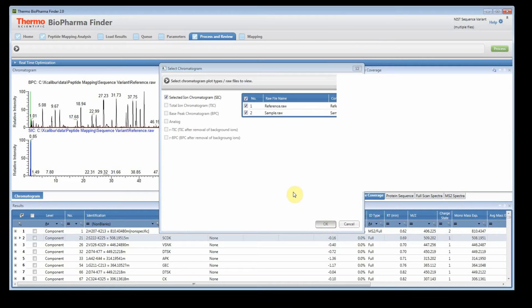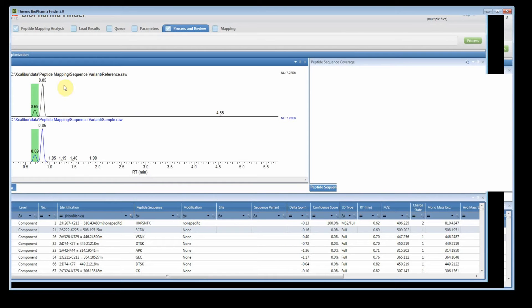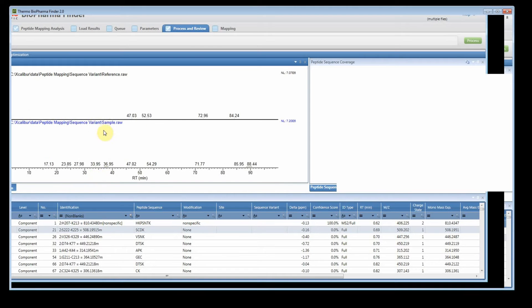Now when I click OK, it's going to start reading both files. And it can take a few seconds here because depending on the size of your files and where your files are located, if it's across the server, it might be a little bit slow on bringing in those files, both of those files. But once it's done, you'll be able to see both files one on top of another. So this is our reference and this is our sample.